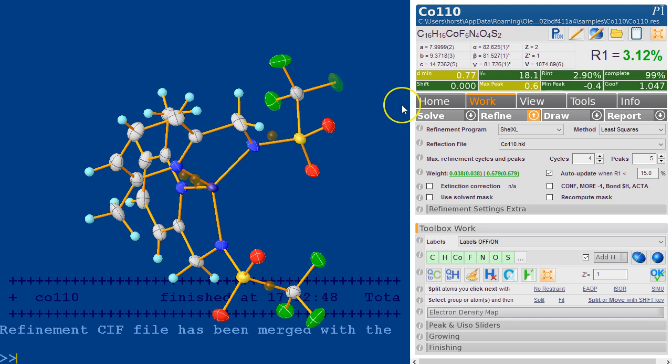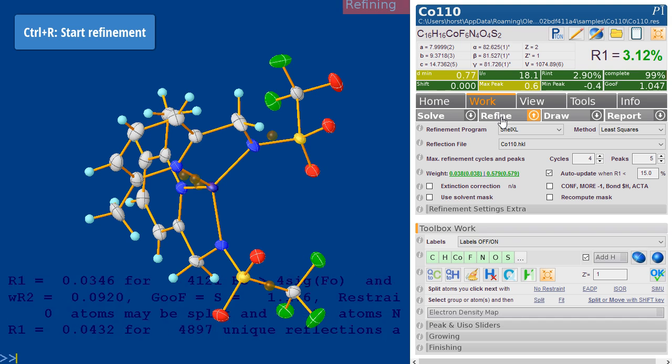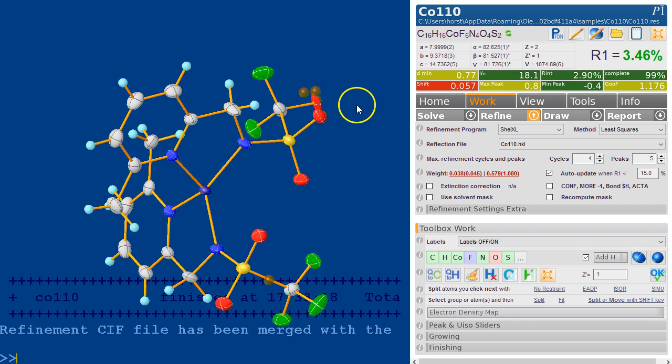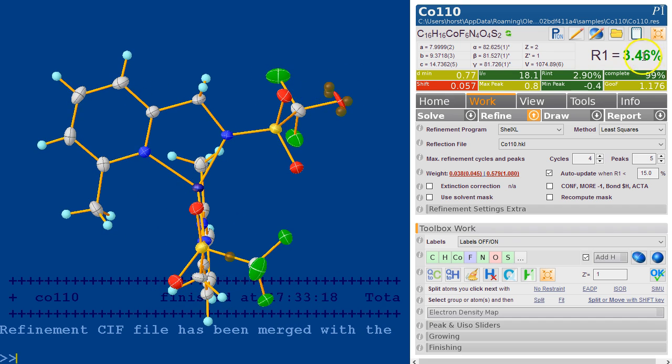Let me show how this works. Let's say we make a mistake and we name this oxygen. So we type name O and we want to refine this. We press refine or control R on the keyboard and this has become smaller. This is obviously the result of the refinement we just had and it's not correct. The R factor has gone up and there's a big shift.